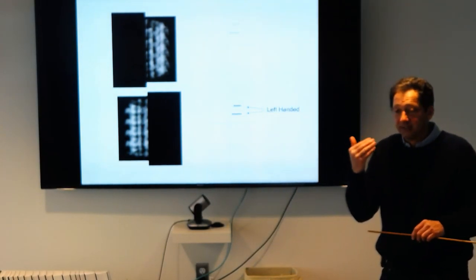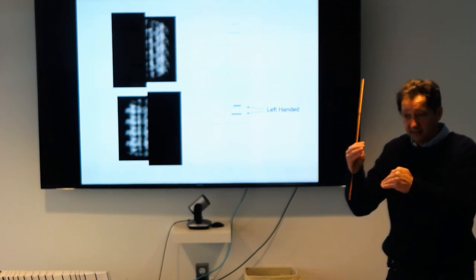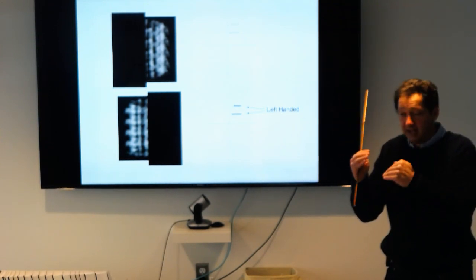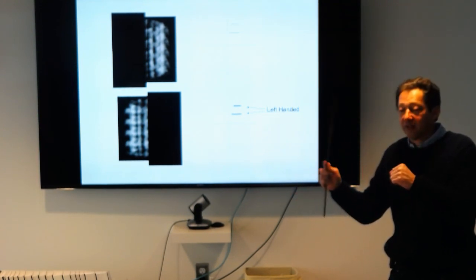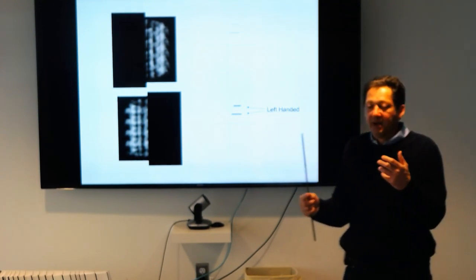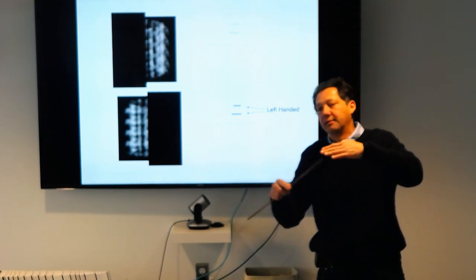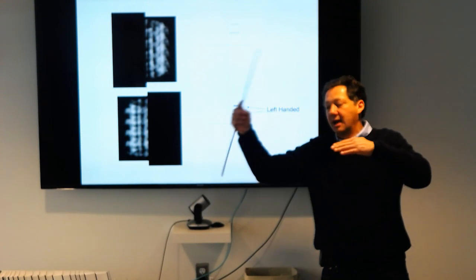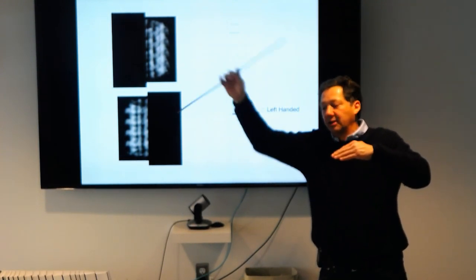So the point is, if you find it for two layer lines, sometimes only two layer lines, which are not orders of each other. When I mean orders of each other, you have, let's say, layer line 1, Bessel order 2, and then another one which will be layer line 2, Bessel order 4.